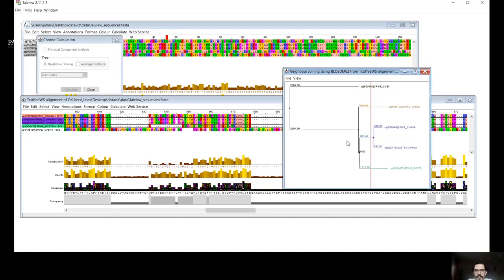So with this, you can see that these are the two most similar sequences. These are these bluish ones, the civet cat and one of the human samples. Then with this green one, this bat is also quite similar. The most distant, yes, is this one, the bovine sequence. And here is the other human sequence with this pinkish color. So with that, you can identify which sequences are closer to each other.